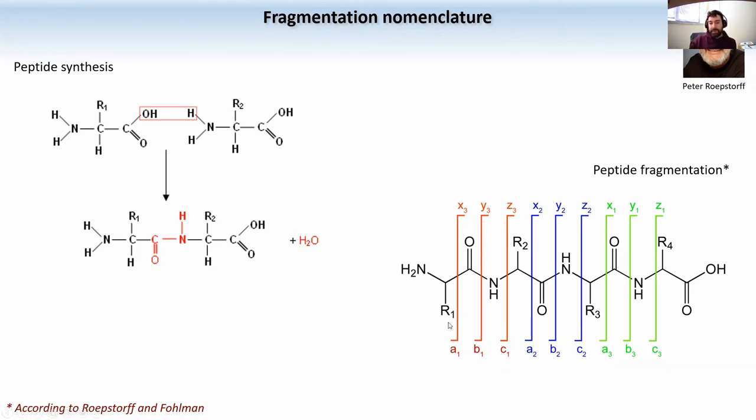And the thing is, if you assume that you have only three types of cleavages, let's say the left end you call A, B, C, and the right end you call X, Y, Z, the B and Y fragments are the ones most probable to form when you hit this molecule with a gas. Why are they the most probable? Because they are the weakest. The bond between the nitrogen and this carbon is the most polarized. The oxygen likes to steal the electrons from here, the nitrogen likes to steal the electrons from here, so the bond that connects these two atoms is not as strong as the others. So when these molecules hit the gas, these are the first ones that fall off.